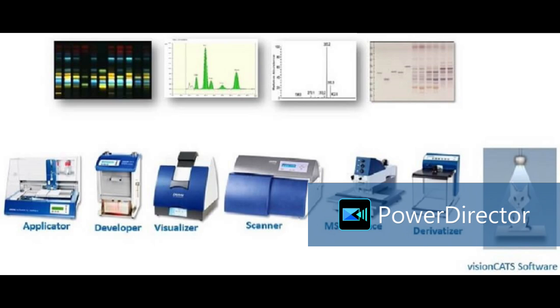Detection of steroids and SARMs. Steroids such as boldenone, trenbolone, nandrolone, etc. you can separate at different RF. This is the image after derivatization under white light and fluorescent light. So you can see the color of each steroid band is different after derivatization, and the absorption spectra is also different, and molecular mass after hyphenation with MS.